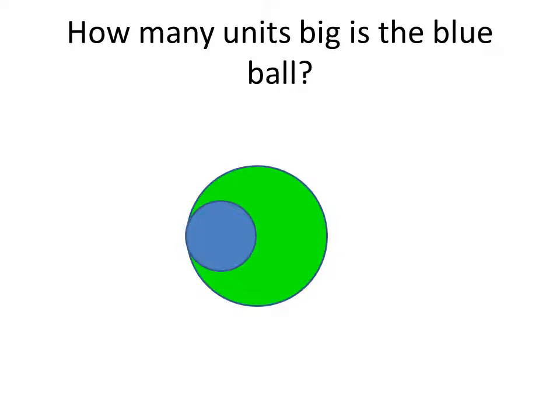You would say, well, this blue ball looks apparently about 1/2 as big, and so if the green ball is 2 units big, then 1/2 of 2, there I am multiplying it, is 1 unit. And so part of it is a function of how good you are at estimating what percentage of that field it is, but if you don't believe me that's 1/2, I'll just show you another one. Yes, it fits.